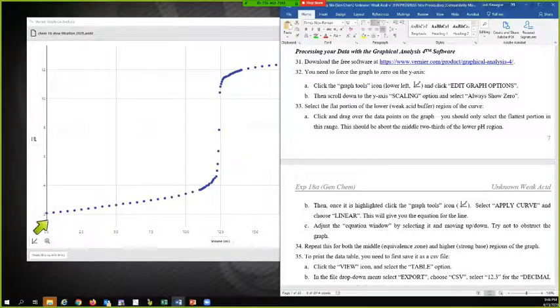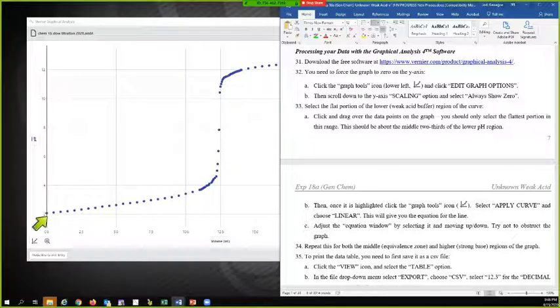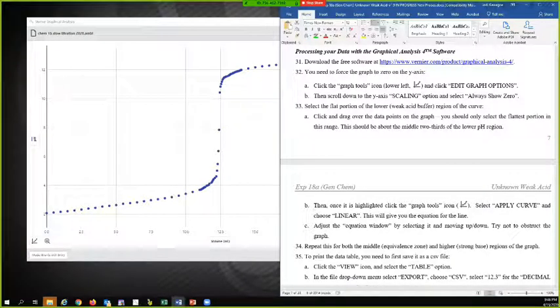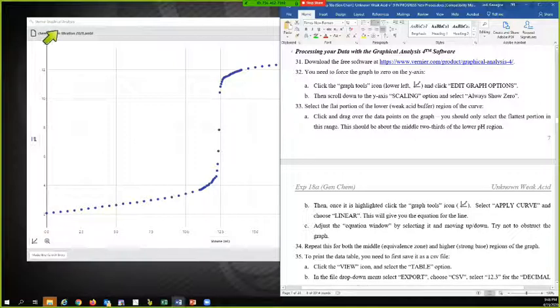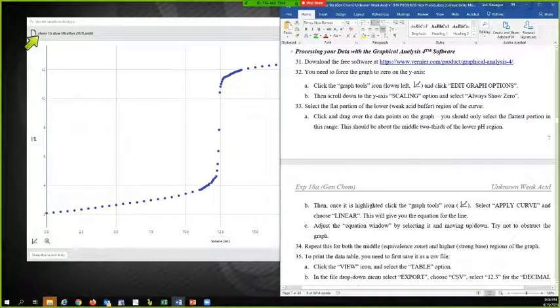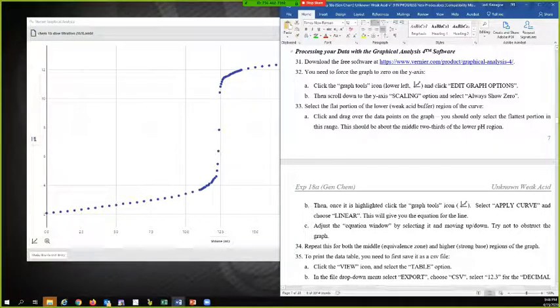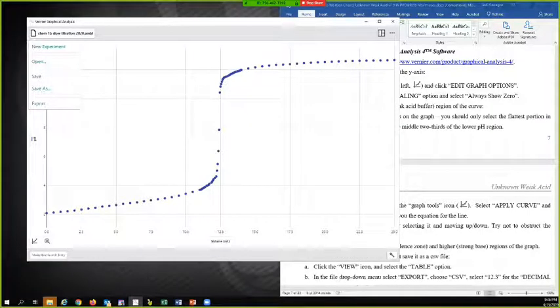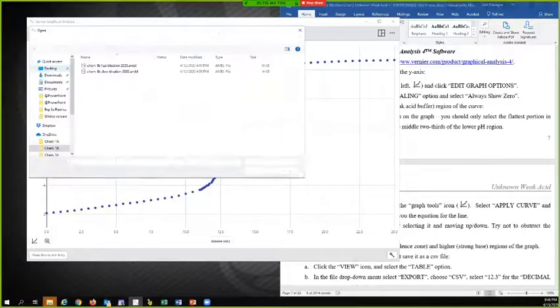If I go and look over here, I just loaded in the slow titration data. And the way you would do that is you'd come up here to this area. If I click on that, it's going to give me this pull down menu.